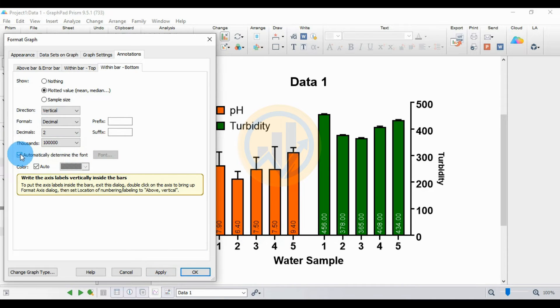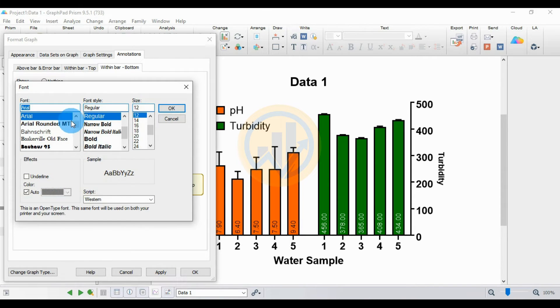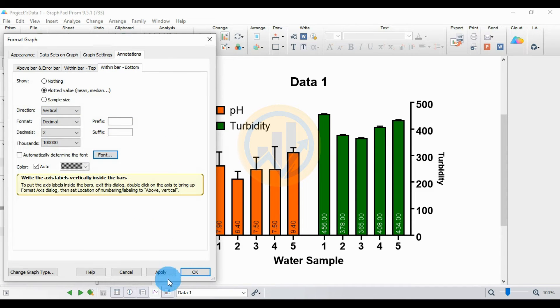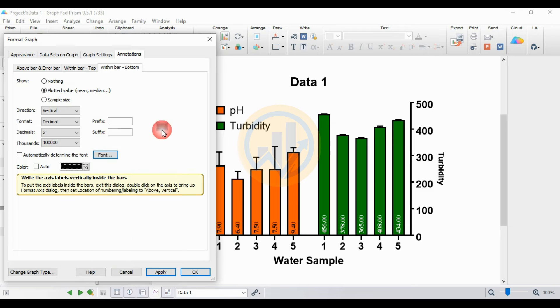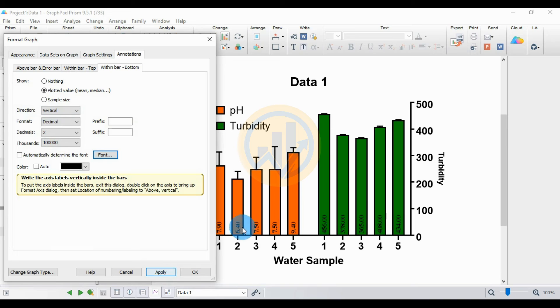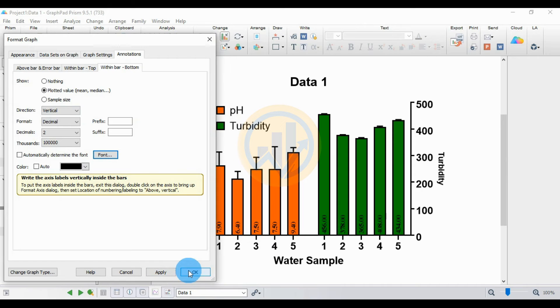The decimal places auto-change to 2 after applying the value. Uncheck the 'Automatic' checkbox for the timer, then click the 'Font' button to change the font. Choose Times New Roman, Regular, then Bold. Click Apply. For the font color, uncheck the auto checkbox, select the dot, and choose black color. Apply bold formatting, then click OK.